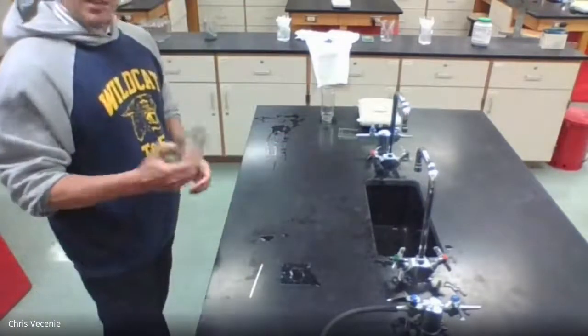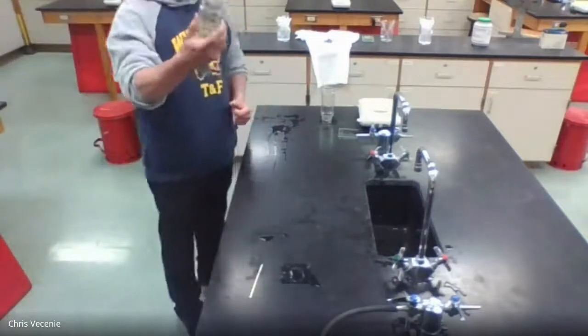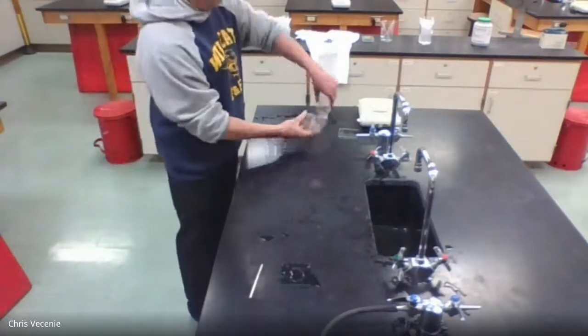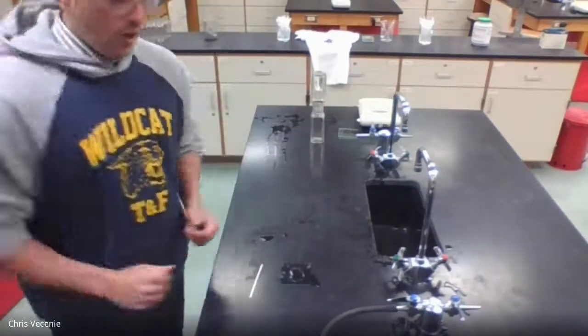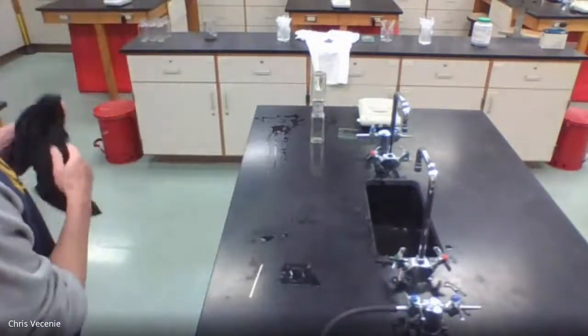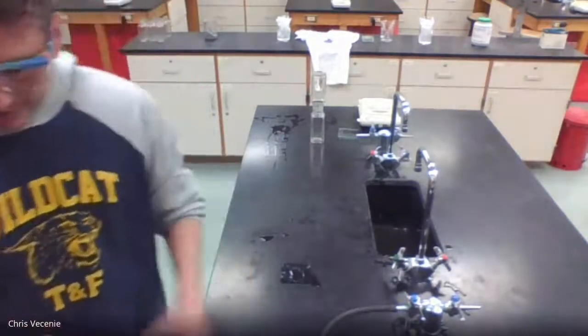And just like the last experiment, I am going to take an air bottle, that bottle I just tested that's now empty, wash it out. I'm going to stack it on top of a bottle that we believe to have hydrogen. Let that mix for 5 minutes. So on my clock, it's 8:38. So at 8:43, I'm going to go and test those.